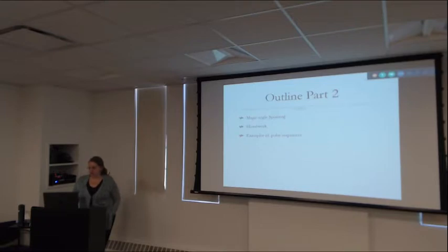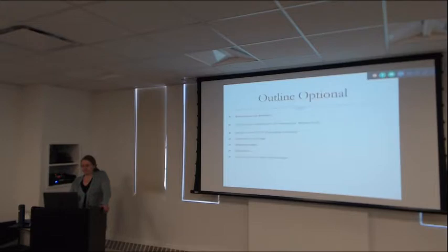Now, the next segment, which if I was going to rush you would be tomorrow, but more likely we'll start at the end of tomorrow and go on to next week, is our target to have you follow the math for the magic angle spinning experiment. It's just an example for those of you who do solution, but it's the main thing for those of you who do solids. So I always pick that as my first example: mathematically, how do you describe the mathematics of magic angle spinning? And then we have a few other pulse sequences.